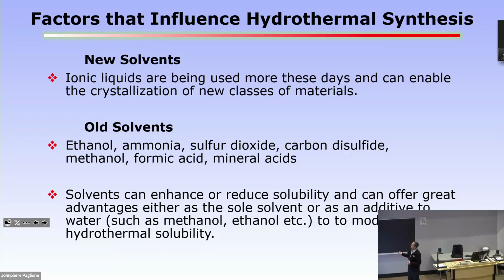Personally, I would stay away from this one. I would probably stay away from this one. This one is okay, but not so easy. The other ones are okay. So just, the other thing is, if you want to use ammonia, you have to liquefy it or push it in under pressure in a different system.